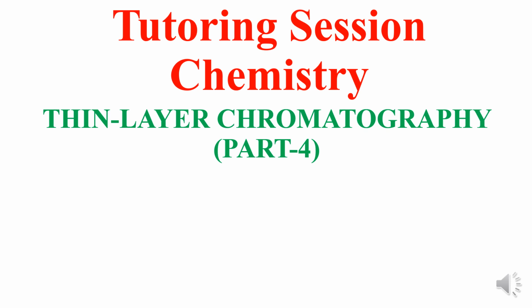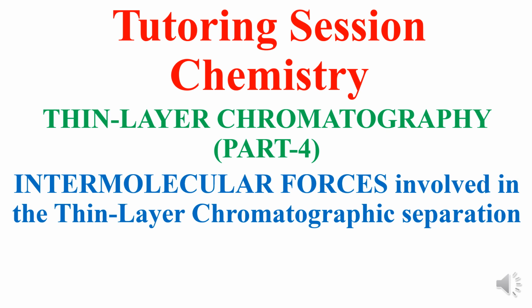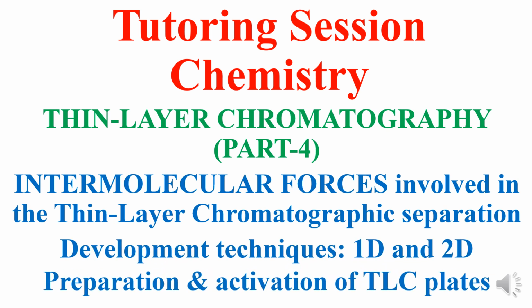The current video is part 4 of the 5-part series in thin layer chromatography. In this video, I'll explain the intermolecular forces involved in the thin layer chromatographic separation technique. This will be followed by a detailed explanation about the development techniques employed in TLC. And finally, I'll end the video with the methods employed for the preparation and activation of the TLC plates.